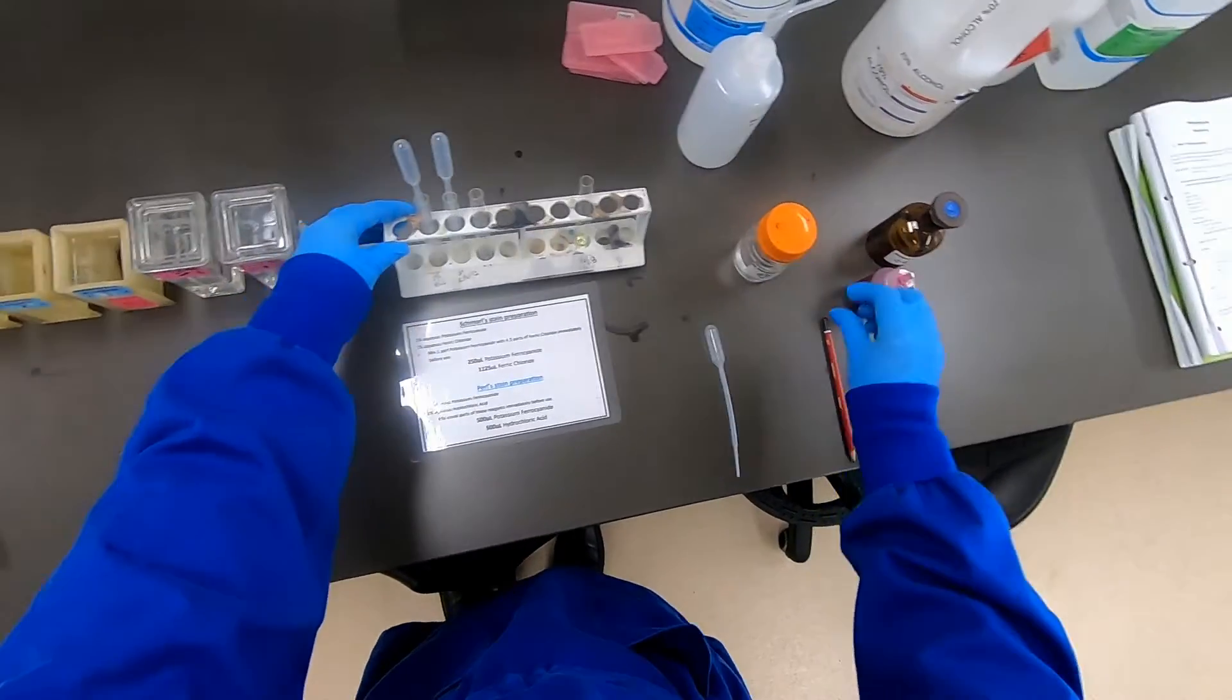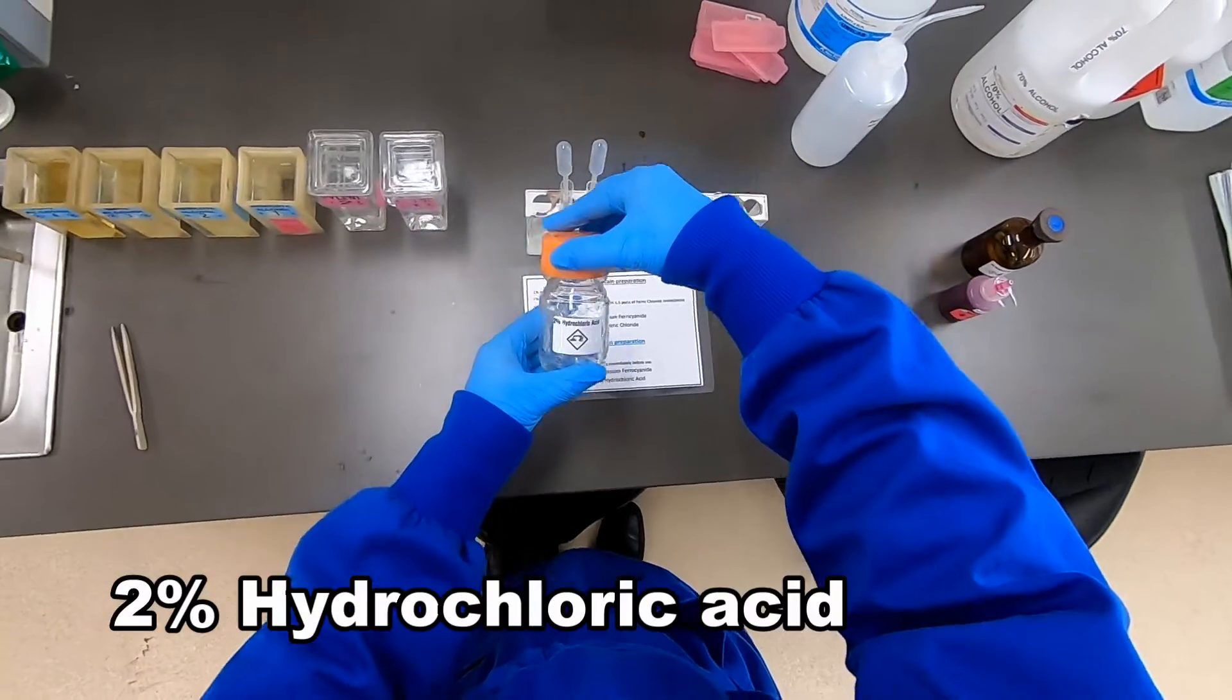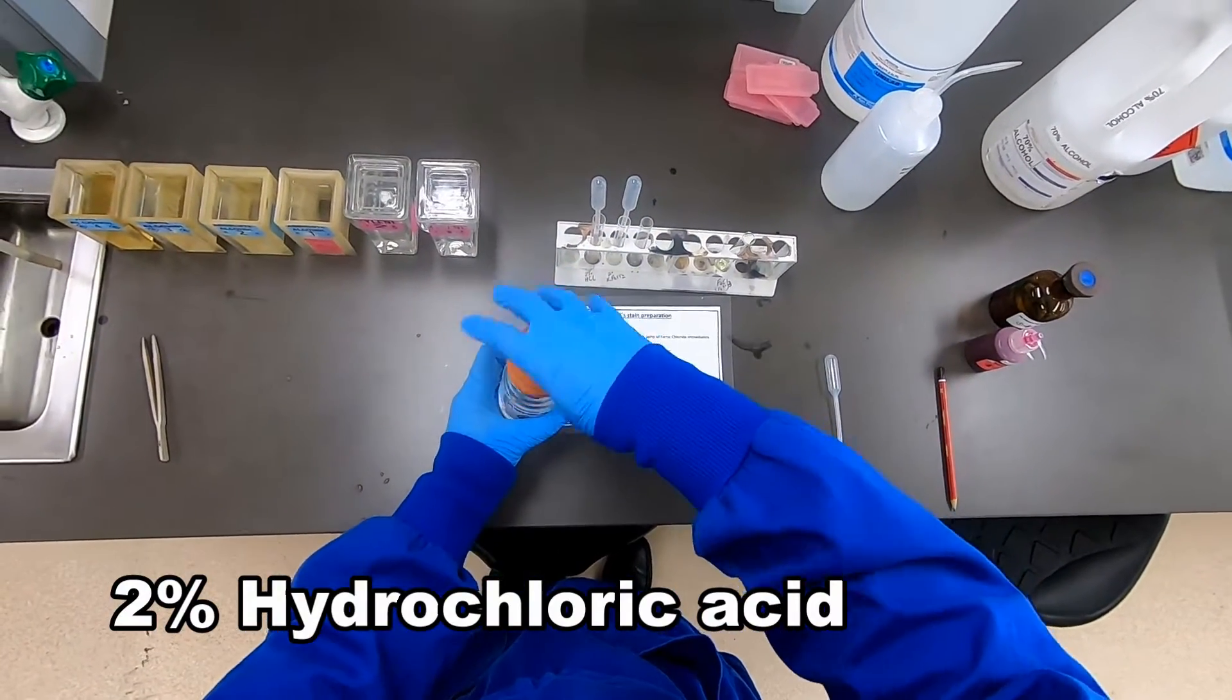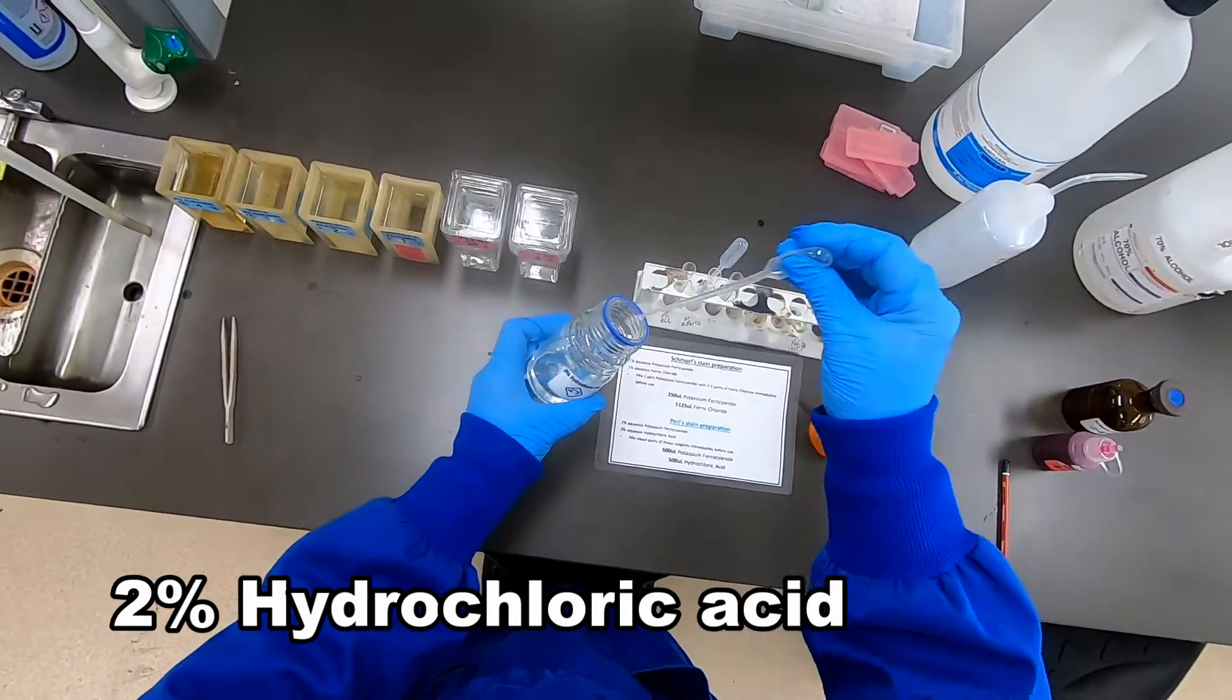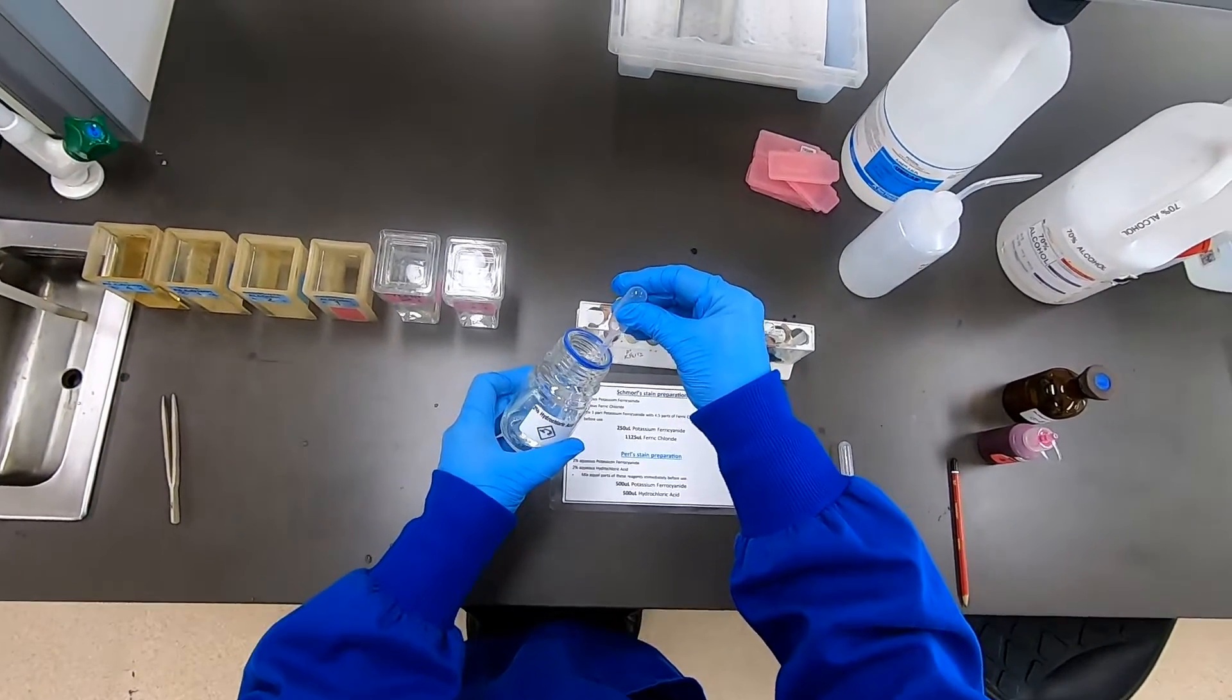After rinsing the slides well, we need to prepare our solution for staining in equal parts of 2% hydrochloric acid.